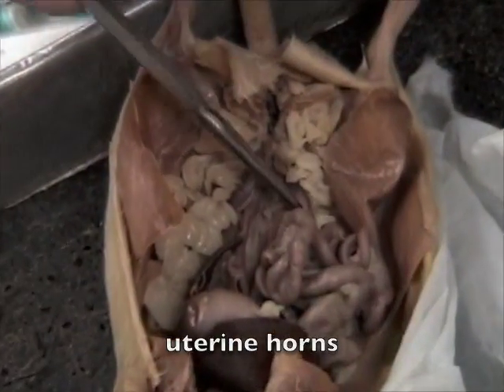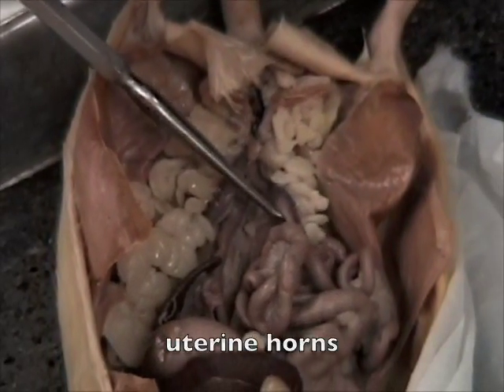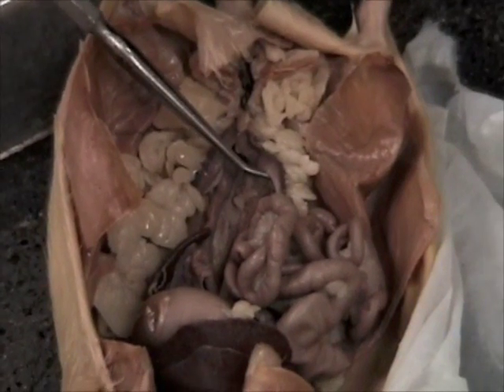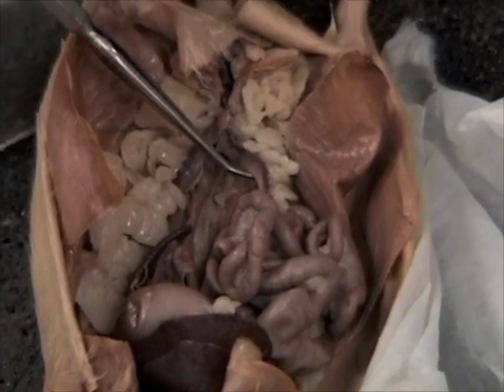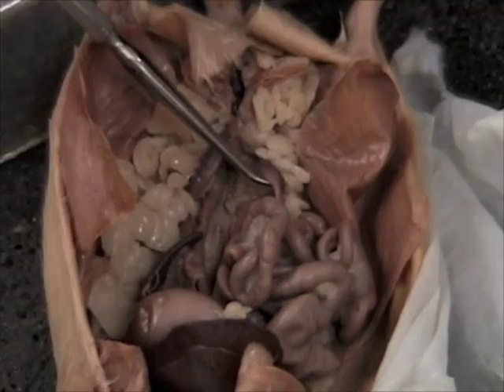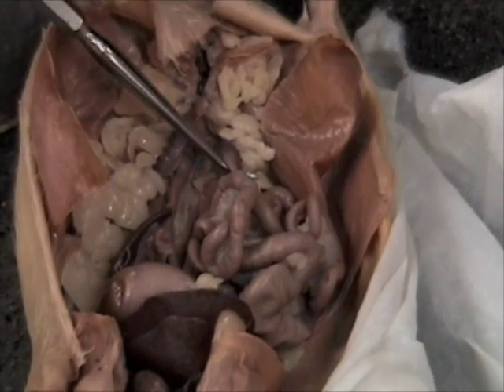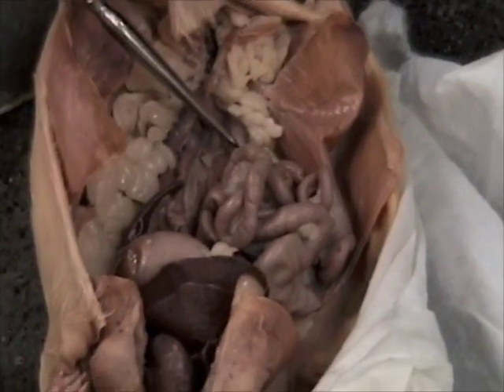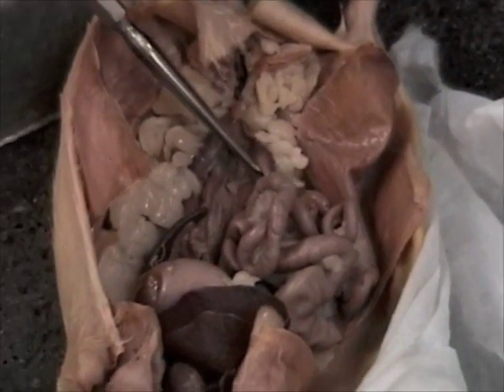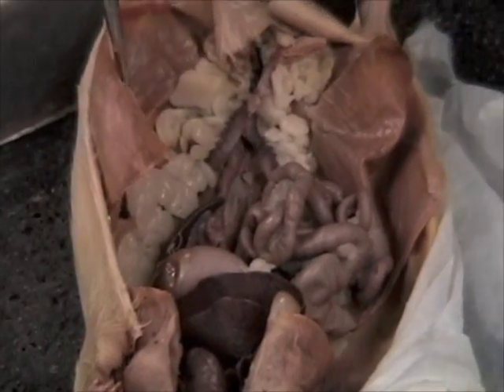Horns of the uterus. Remember that these guys, unlike the human female, have uterine horns, which is the reason why human females don't have litters. That's why these animals can have litters.